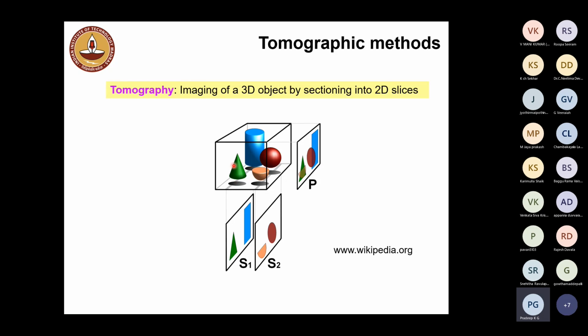And therefore, we require advanced techniques because this is sort of preliminary information, but not complete information. It's like misleading information because the three-dimensional features are not visible anymore, and the dimensions are now interpreted in a very different way. So if you want to get a better, real description of the objects in three-dimensional space, then you can slice layer by layer of this object.